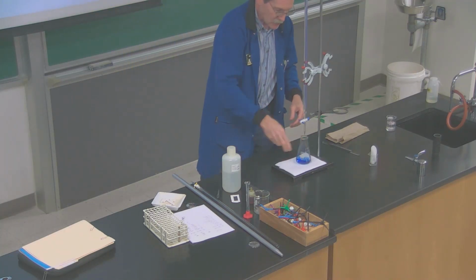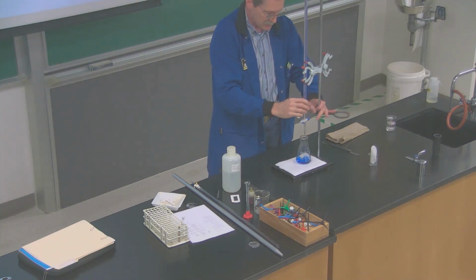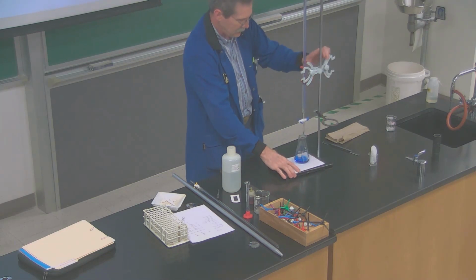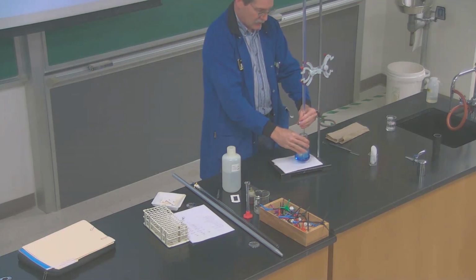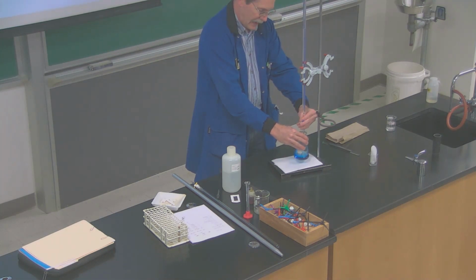And so when you titrate, you'll want to have something white underneath this so you can see the color change more easily. And then just titrate and twirl or mix it while you're doing this. You may want to go a little more carefully than me, but with white you can see where the acid is going in that we're getting a bit of a yellow color. That will start to persist as you get closer to the end point. And the end point in this is a little squishy.